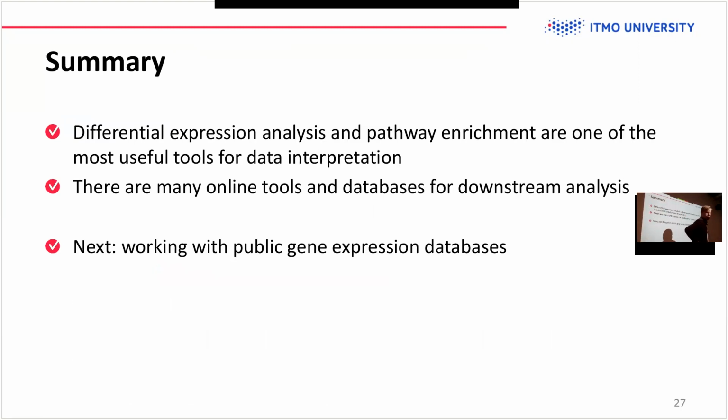Okay. And to conclude this part, differential expression analysis is the very simple and most straightforward way to analyze the data if you have two conditions that you want to compare. And pathway analysis allows you to go from individual genes, which is usually hard to argue about. You would like to argue about important genes, the genes that you can knock out. But usually there are many differentially regulated genes, and it's much easier to first argue about the biological processes, which can be done on biological pathways, through pathway enrichment analysis.